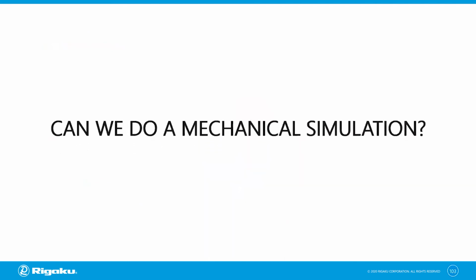Now, the last example I want to show you is an example of a mechanical simulation. A mechanical simulation is really not CT analysis at this point anymore. But I wanted to show you this example to make a point that there are many different next steps you can take after you do a CT scan, and a mechanical simulation is one of them.